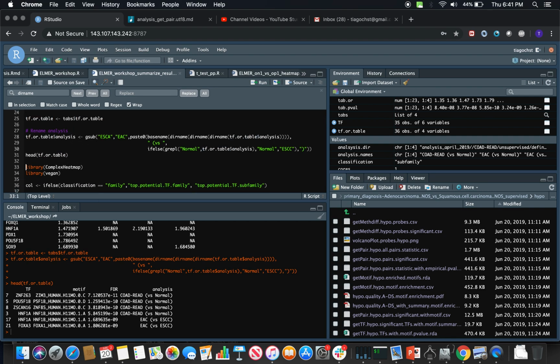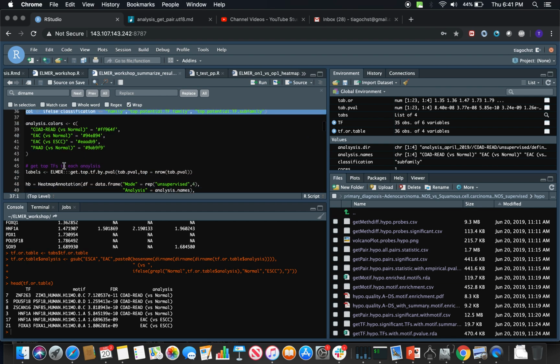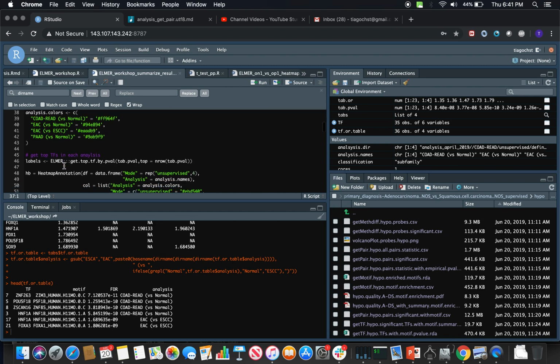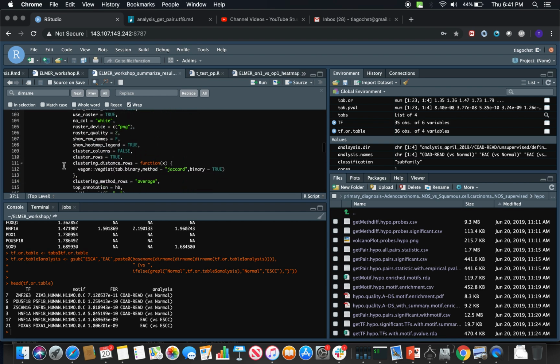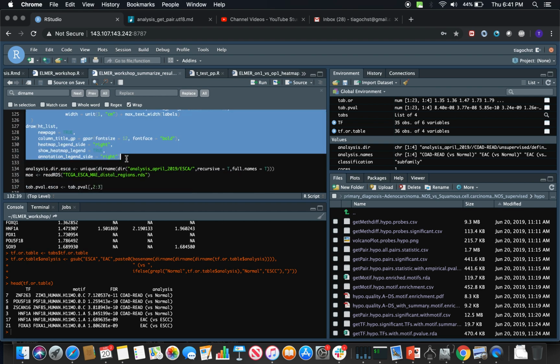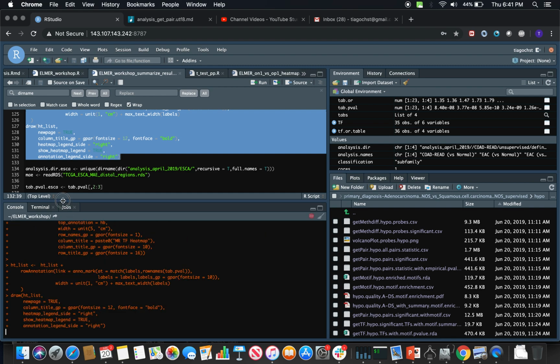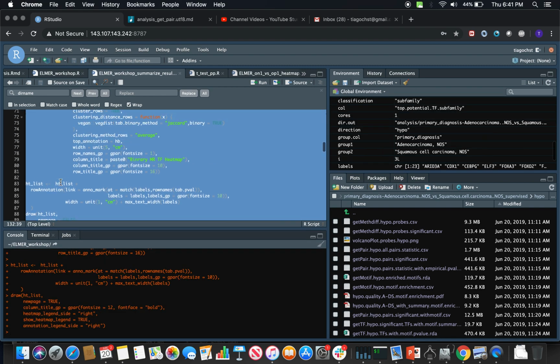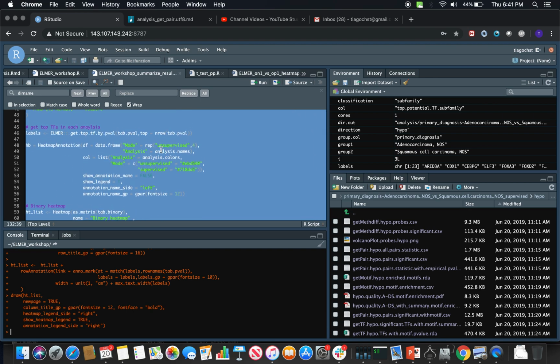And then we're going to plot. So the first thing we are going to do, we're going to plot the binary table. Okay, so the heat map here, I'm going to execute here. Let's see. Okay. Then if you run this, I'm going to try to explain the code line by line. Let's see. You should have the heat map drawn.